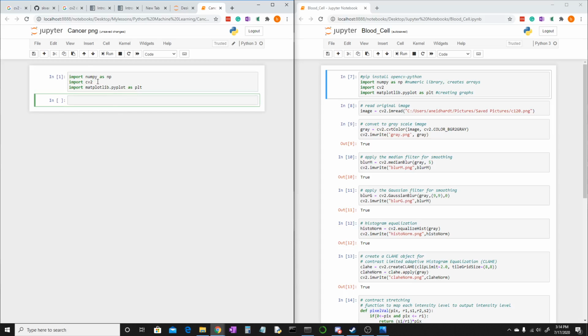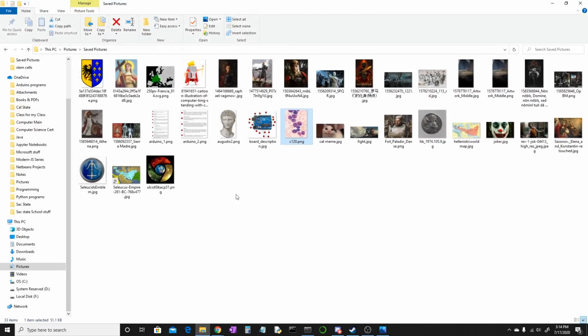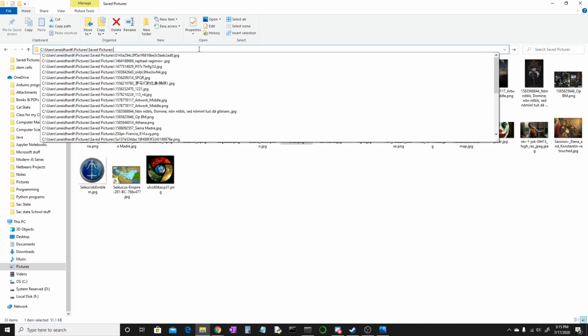It's actually referred to as OpenCV, and there's a difference between cv2 and OpenCV. But cv2 allows us to read and write to images and manipulate them as we see fit. So we're going to create an object in Python called image, and we're going to set it equal to cv2.imread, parentheses. In here, you're going to find where you saved the picture, slash and the name.